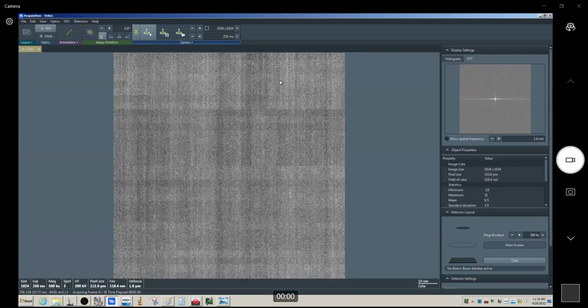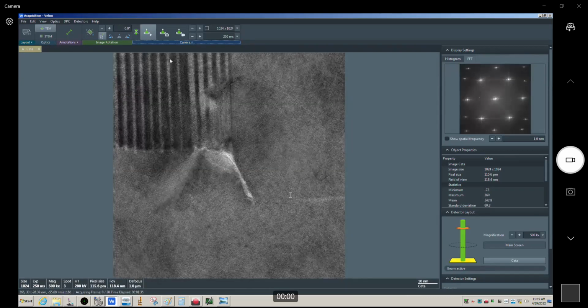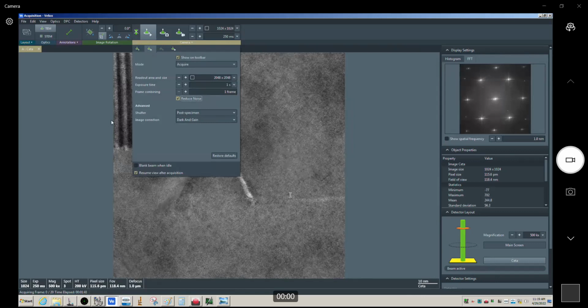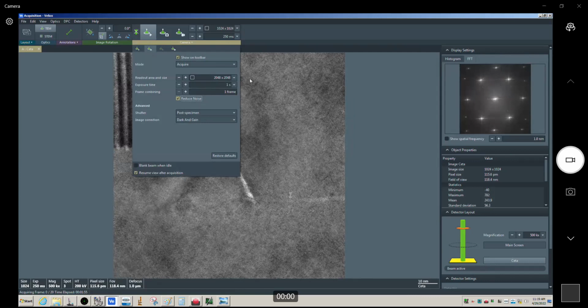Okay, I kind of briefly touched on this earlier, which was how to pick the exposure time. In the SOP, we're assuming we're doing one frame here. For regular conventional imaging, whether that's bright field or high res, if you have a sufficiently thin sample, then 1 second should be plenty.